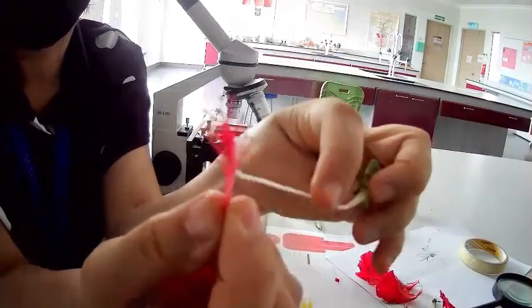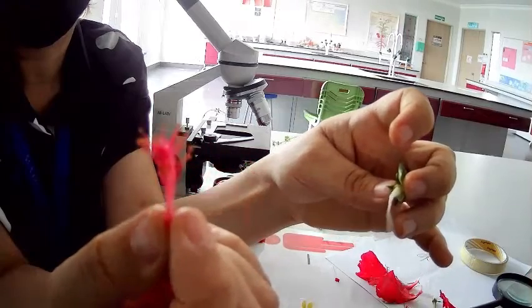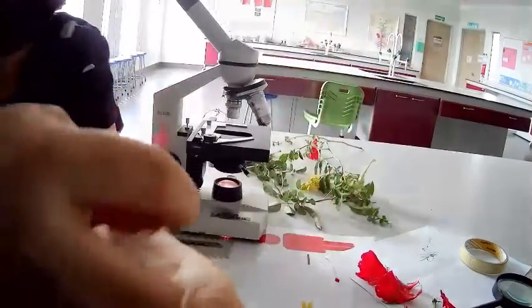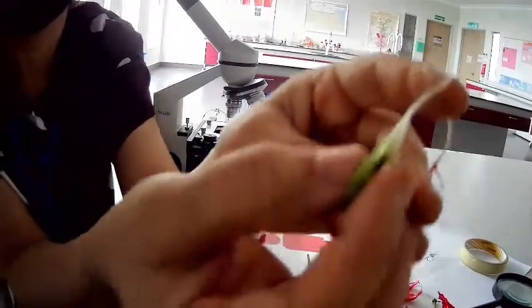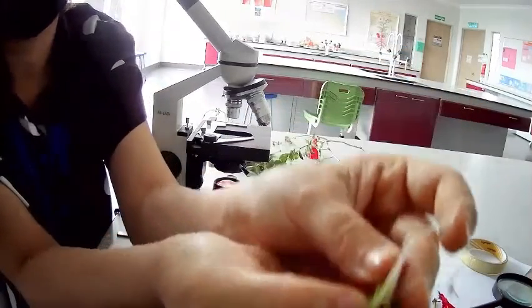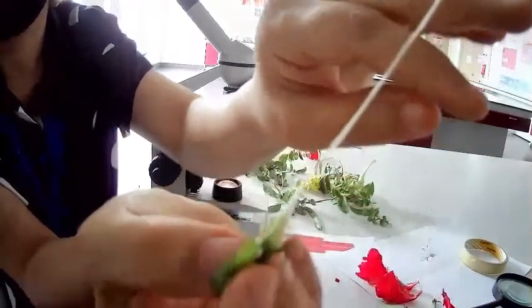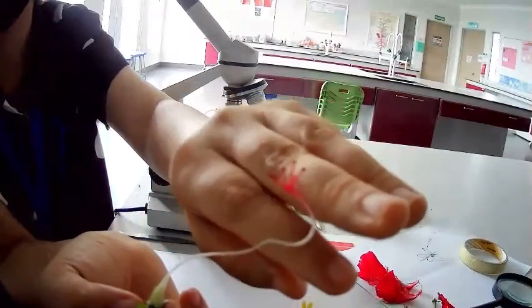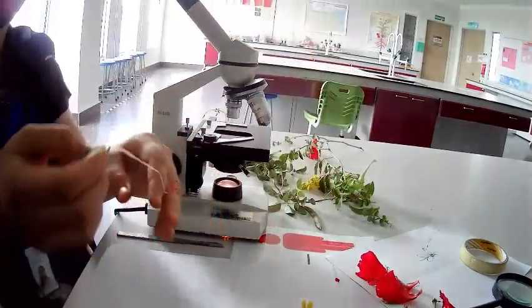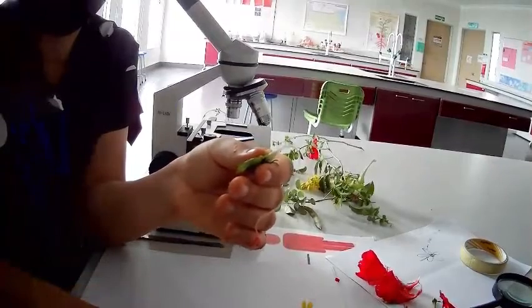This is a style of the female, and I pull, so this whole female part came out. So these are sepals, looking like small green leaves, and then this is the ovary, the swollen part, and then the longer style, and at the tip of it is the stigma. But this one has five stigmas, as you can see. So I want to show this one also under the microscope so we can see better.